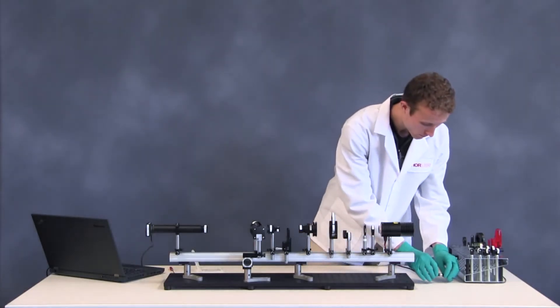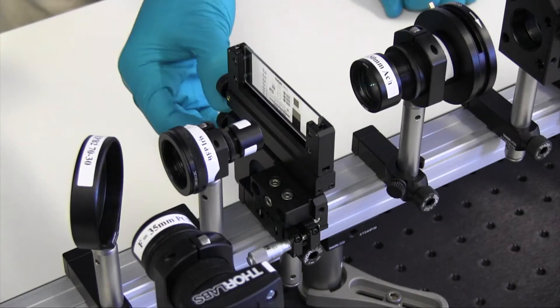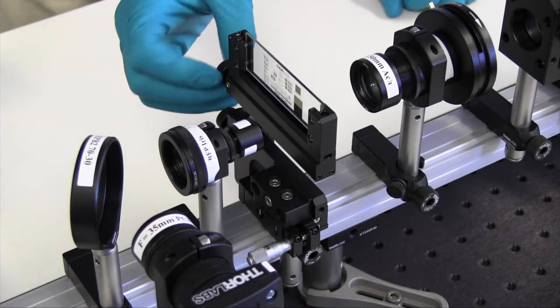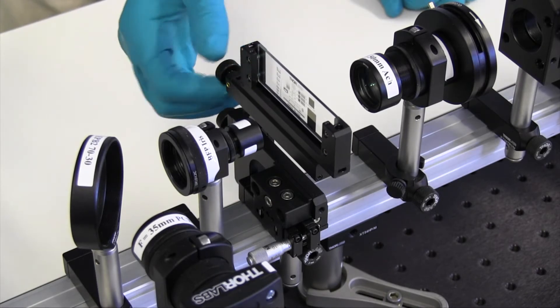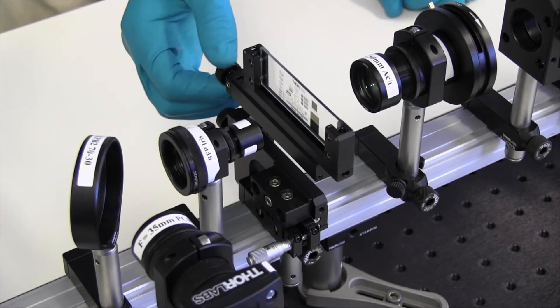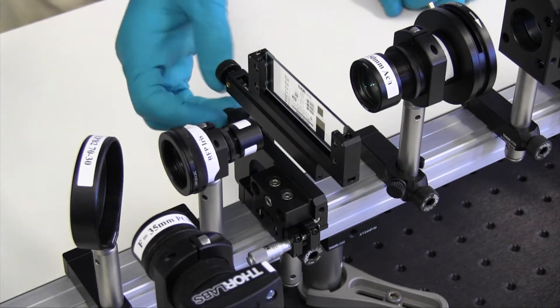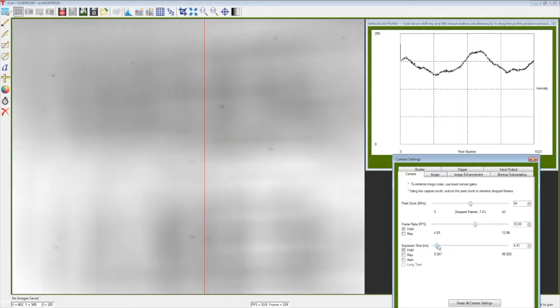Turn on the lamp. Adjust the position of the sample stage with the adjuster knobs until it is in the middle of the light path. Also, adjust the stage micrometer until it is in the middle of travel. In the ThorCam software, open the line scan and set the exposure appropriately to avoid overexposing the image.